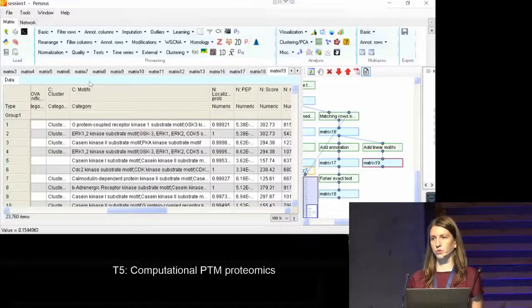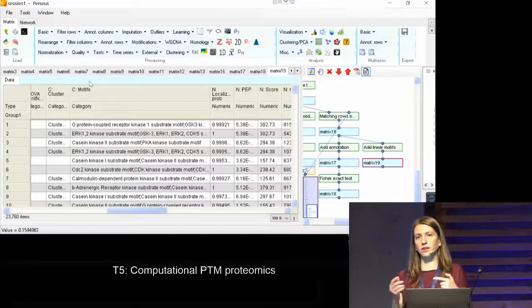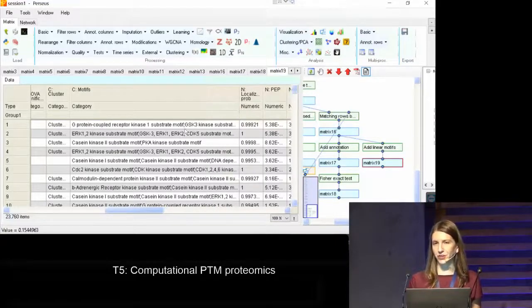So for example, you know that some of them do have this specificity. For example, at the first position after the modification site, there can be a proline, and this is one of the proline-directed kinases. So Perseus uses the sequence to match to motifs that are predefined. I can actually show you, and then it imports a hypothetical kinase that might be the one that has modified this site. So I actually see that for each site there can be quite a list of such kinases.